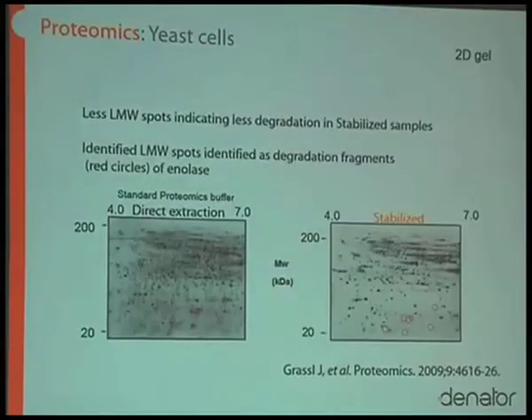So I also have one example. We just recently released these, but we have one example where we stabilized a liquid sample. In this case, it's yeast. It's not an extract. It's live yeast cells. So they're grown, they're harvested and washed, and then they're suspended in PBS, and then they're heat stabilized. And then we did the extraction in 8 molar urea and separated them using 2D gels. And in this case, we focused on these.